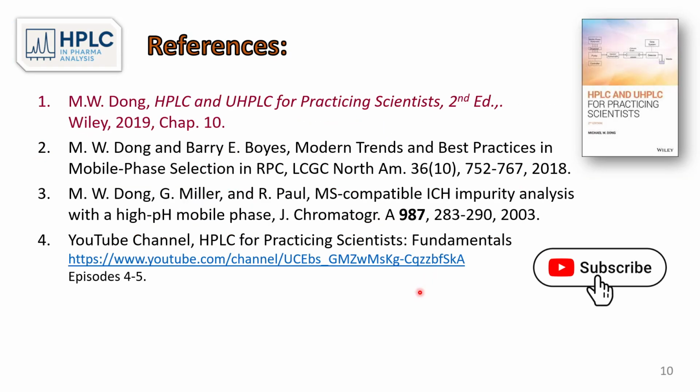Here are some references. Chapter 10 of the book, two white papers, one white paper published in 2018, and one technical paper in Journal of Chromatography on high pH separation under ICH impurity analysis. And also the YouTube channel, episodes number 4 and 5.